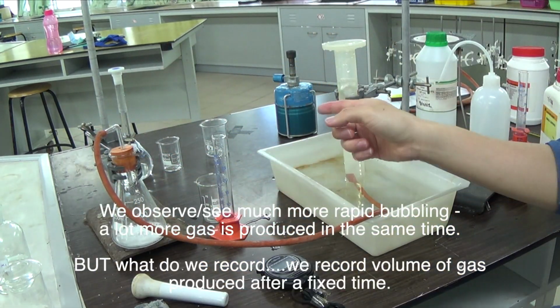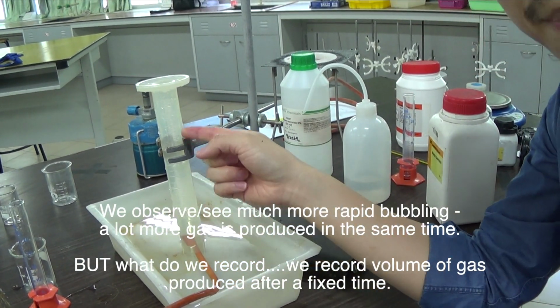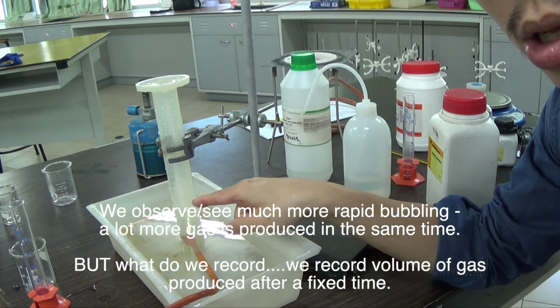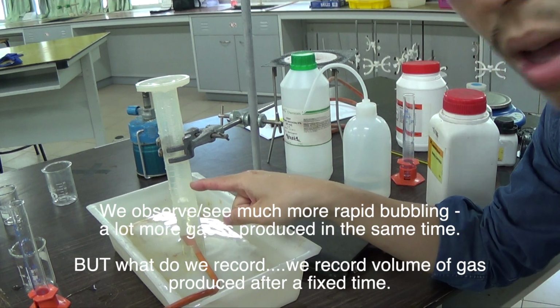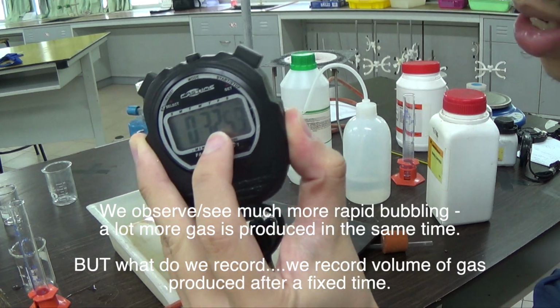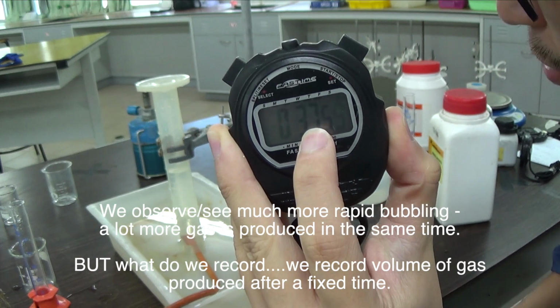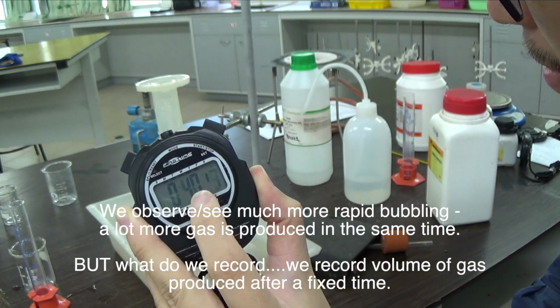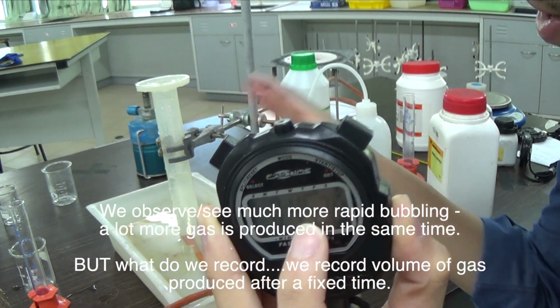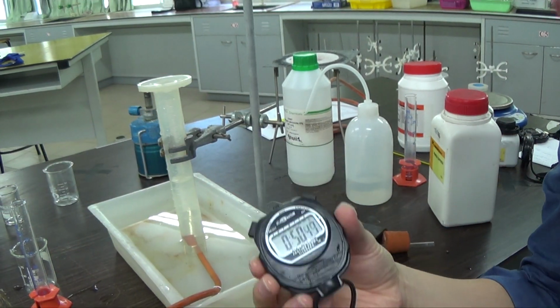As you could see, very rapidly. As you could see just now, the bubbles, very rapidly, all the way suddenly is already there. You could see the rate of bubbling is a lot faster compared to just now. And you can see there's a lot of volume of gas produced. You need to take away the 10 seconds, so I'll stop timing at 2 minutes 10 seconds. I believe that this reaction might produce a lot more gas than that. So my measuring cylinder might not be enough. I haven't done an exact calculation of the amount of gas I should get, but this should give you an idea that the powdered form reacts so much faster.